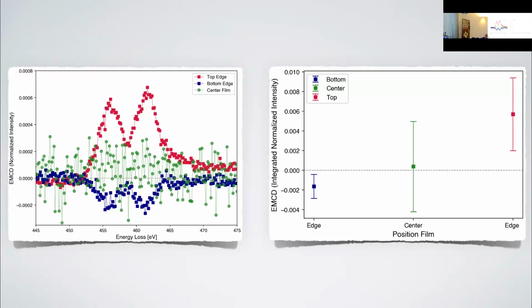Now, if you use the sum rules for the orbital momentum, to which magnetic moment would the signal you obtain correspond? It's just orbit, there's not a spin in there. I haven't done the sum rules, but everything will come from orbit. You ask which orbitals these come from? In principle, this signal comes from a current-induced magnetic moment.